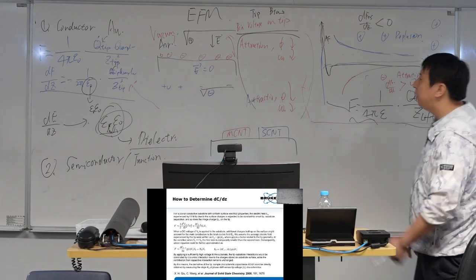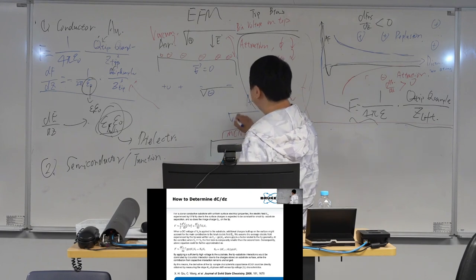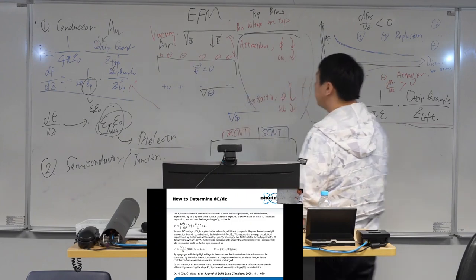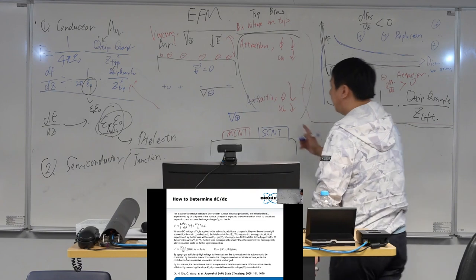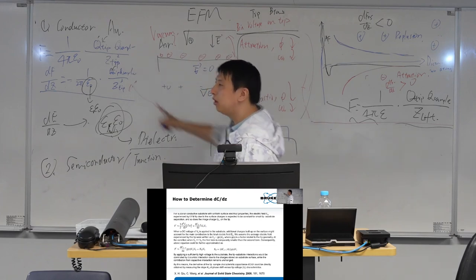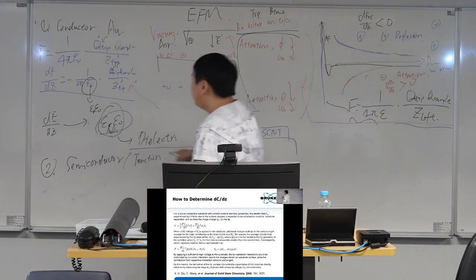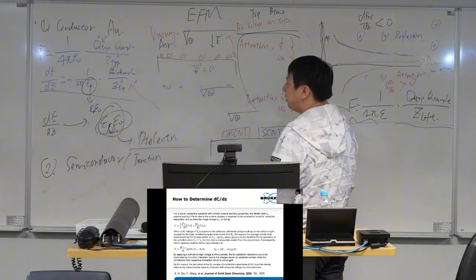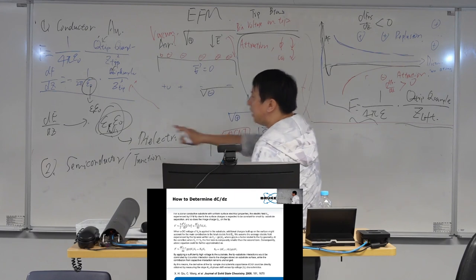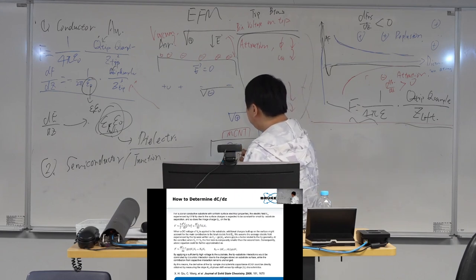And in the EFM, we follow the same way. We apply a positive voltage. For example, positive. You know, positive and negative are actually the same. You apply a positive voltage, and the metal carbon nanotube plays the same role as a conductor. You will get the dF/dz or dω/dz, and this you actually get on the metal carbon nanotube. This gives you epsilon over L, right?